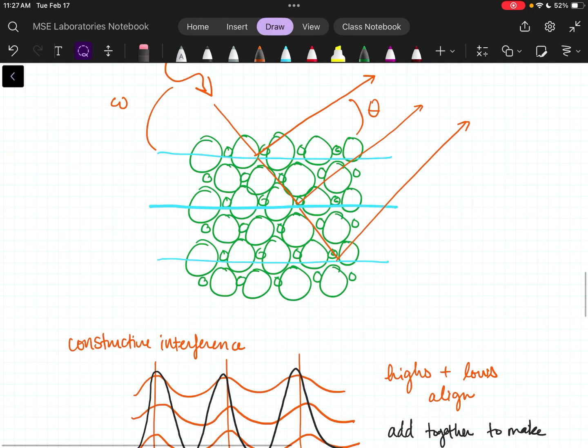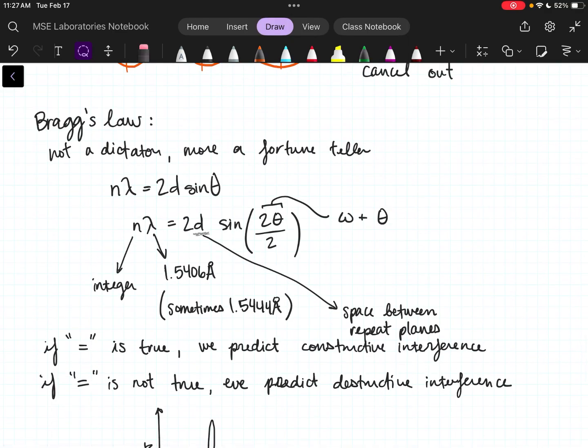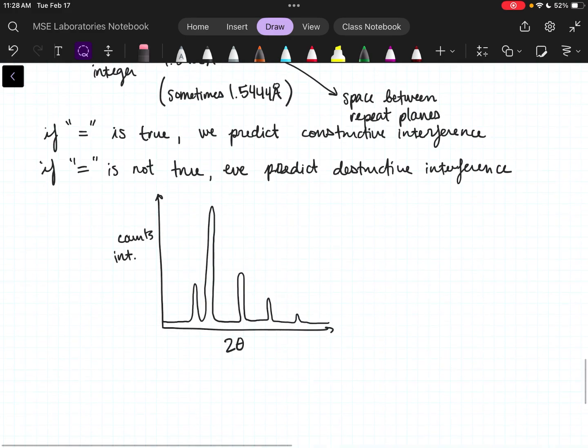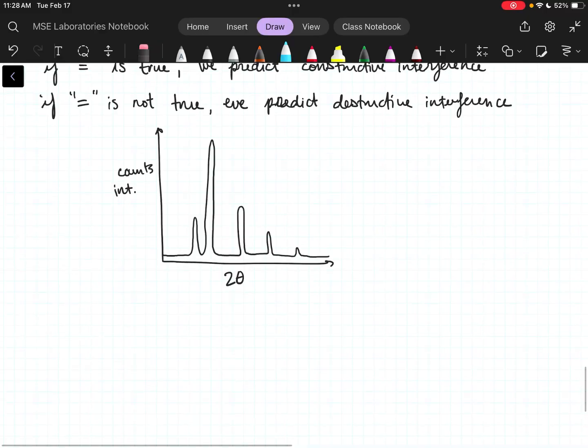When I threw this sample into the XRD, I am able to measure my source angle, I can measure my outgoing angle, and I know my wavelength, right? I even wrote them down here. The one unknown when I stick my sample in is usually that D spacing. Yep. So to do some example calculations, super fun.